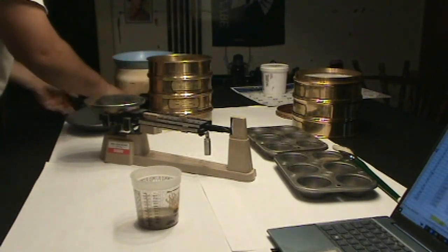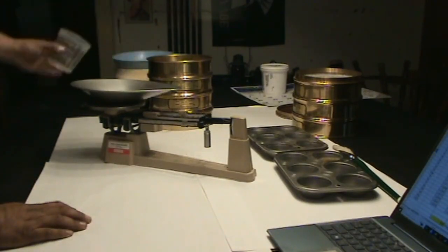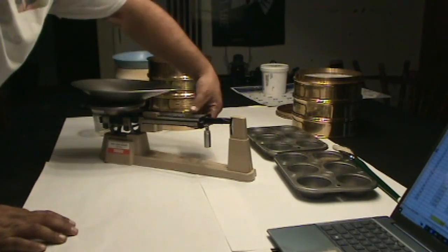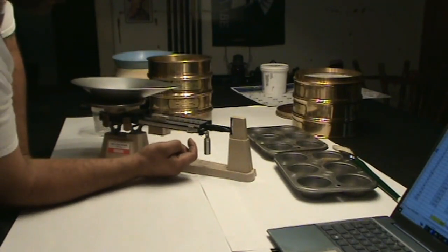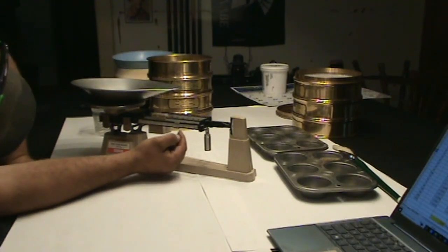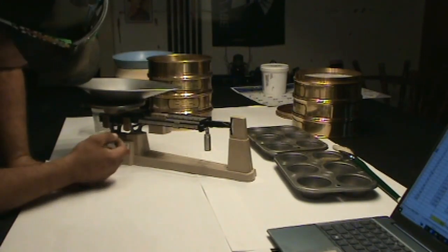The rounded shape of this Texas sand makes it very desirable for use as filter pack material. California sands are typically angular, which can cause them to lock together during well development. This condition has a tendency to restrict water flow into the well and thereby reduce overall production. Sieve number 16, 116.8 grams, 35.39%.